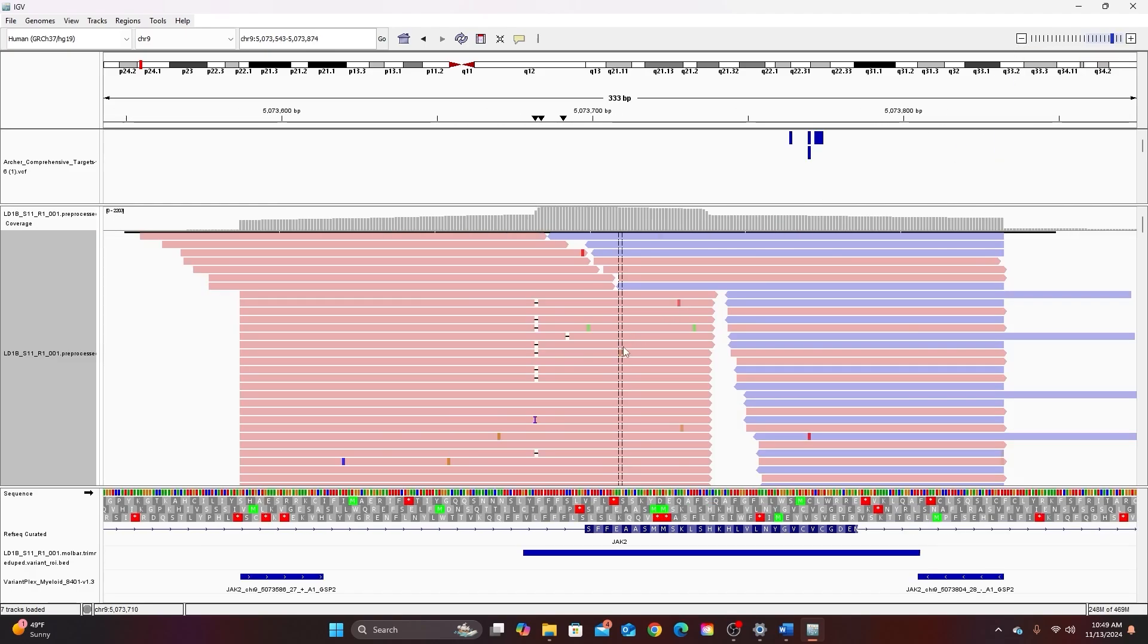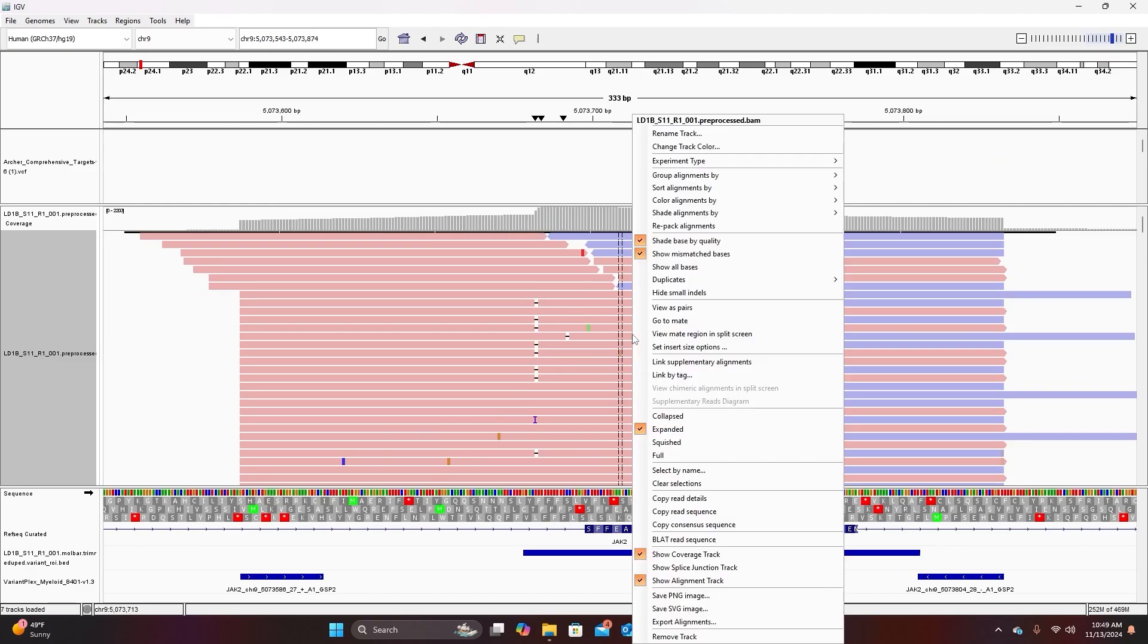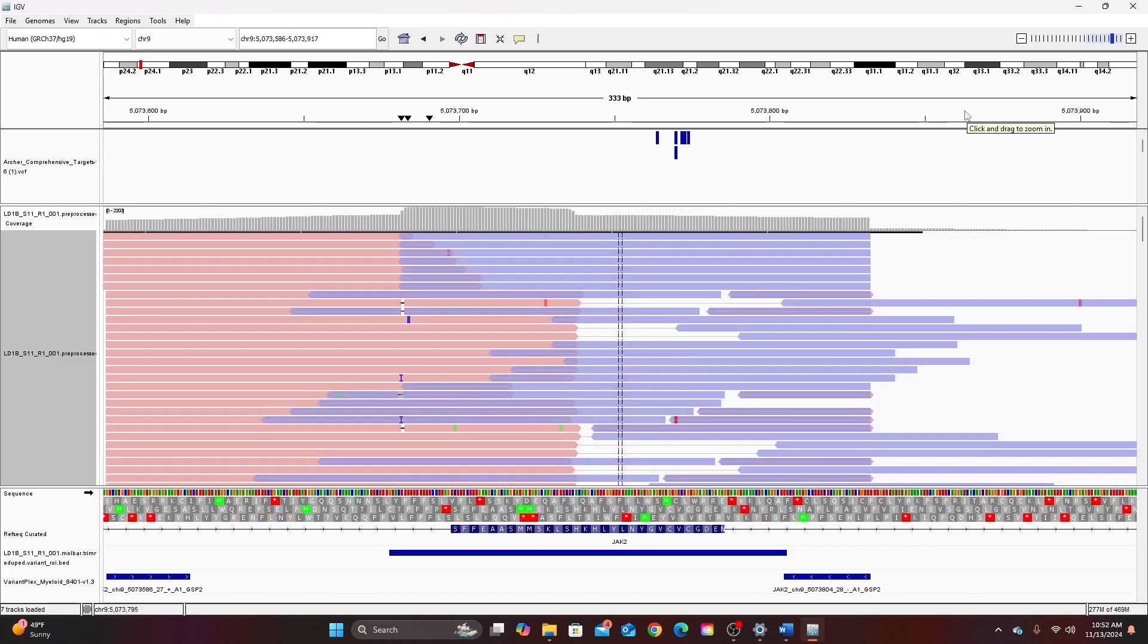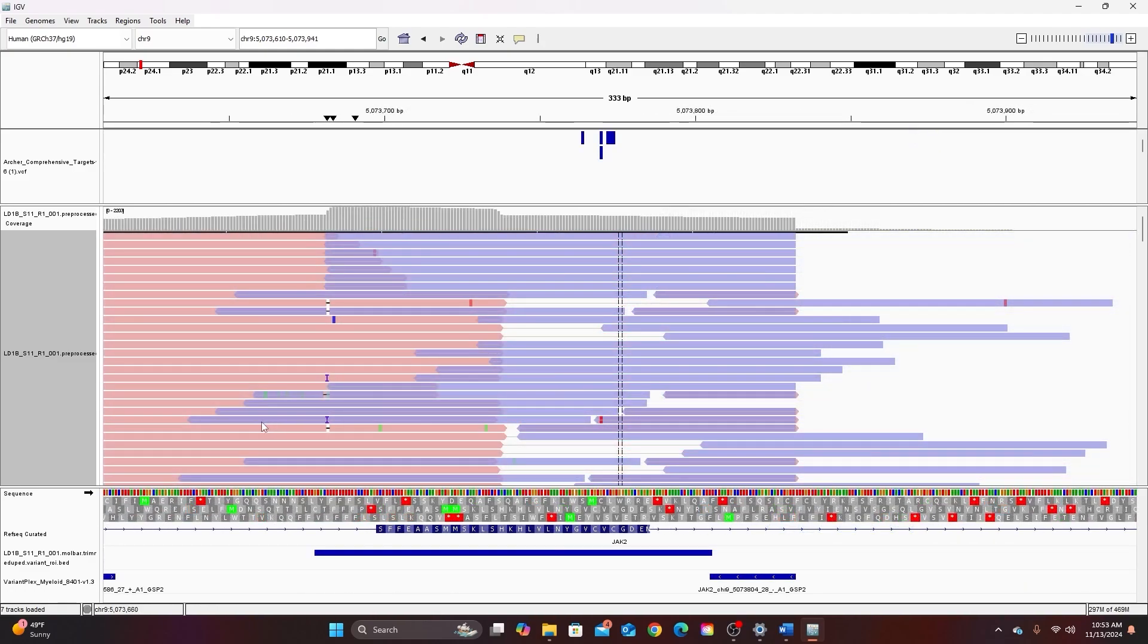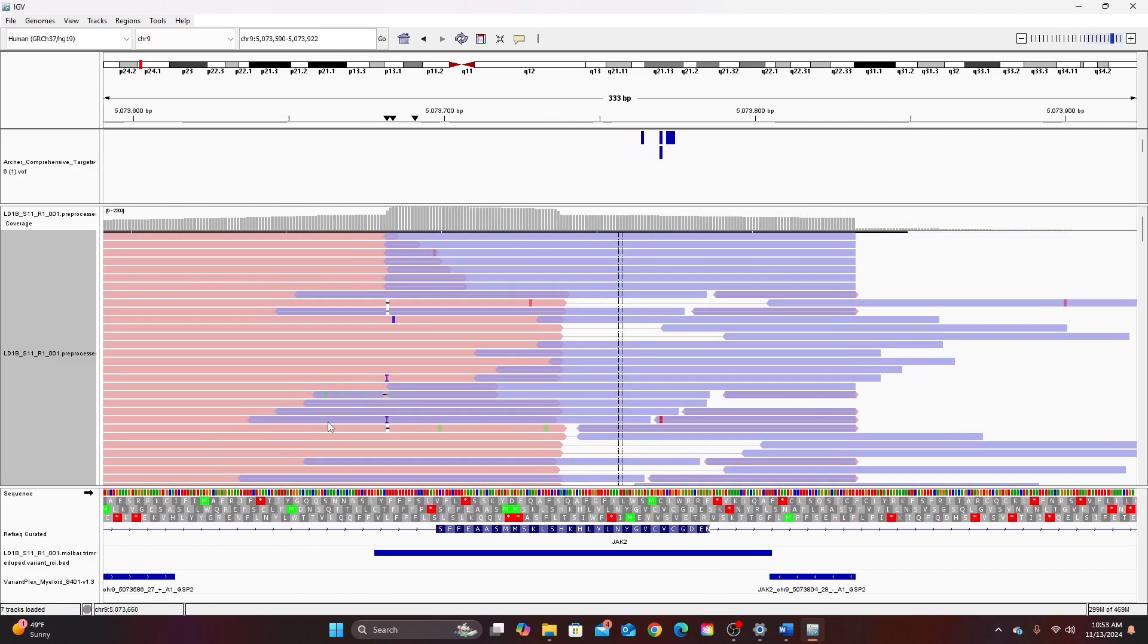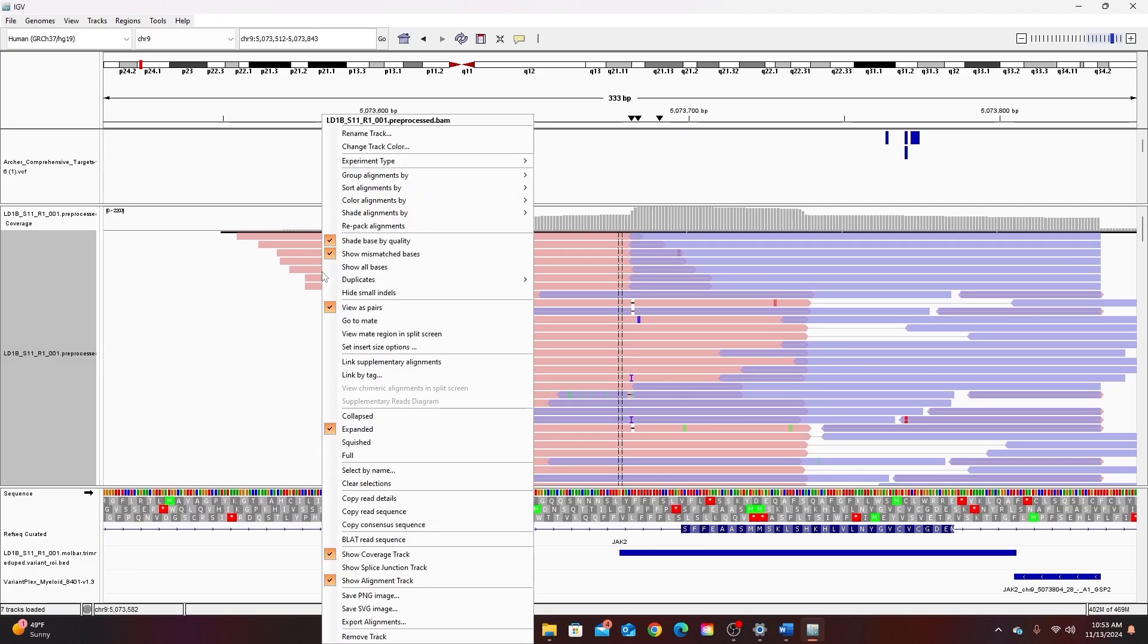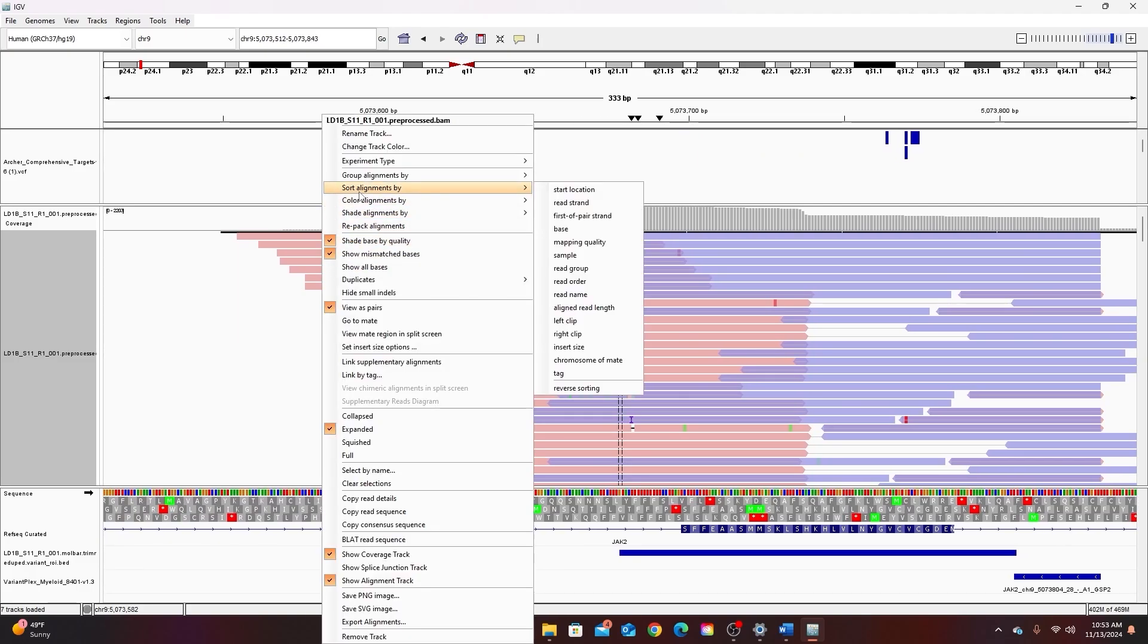Another useful option is to view as pairs. I'm going to zoom out to look at this option so if I right click again I can view as pairs. Now our sequencing chemistry is paired-end sequencing which means that every amplicon is sequenced first in the forward direction and then in the reverse direction resulting in two reads, a forward read and a reverse read. So this view shows each forward read with its mate, with its reverse read.